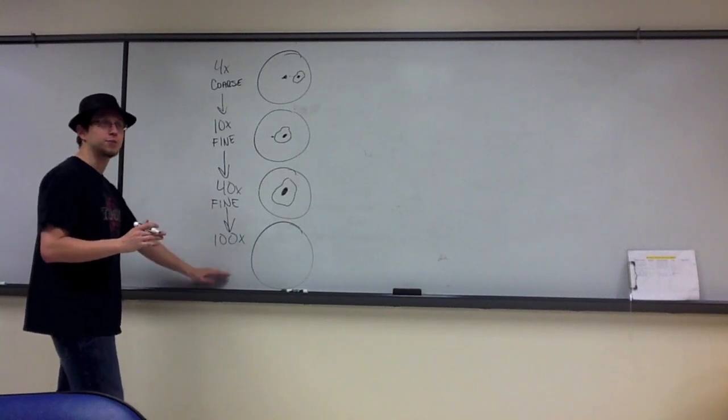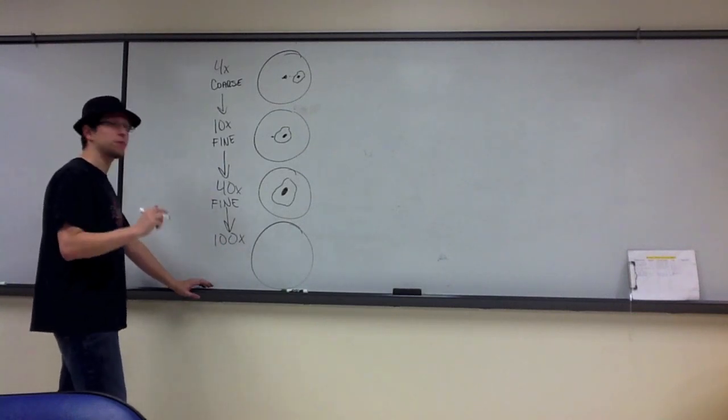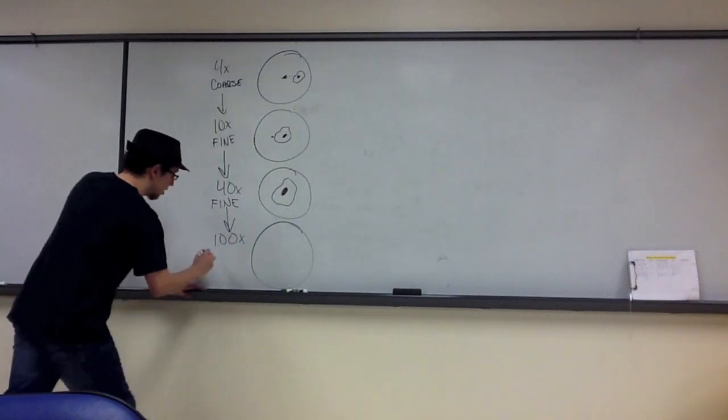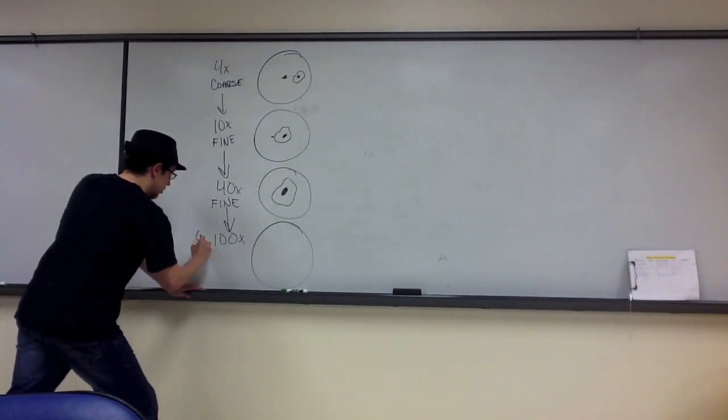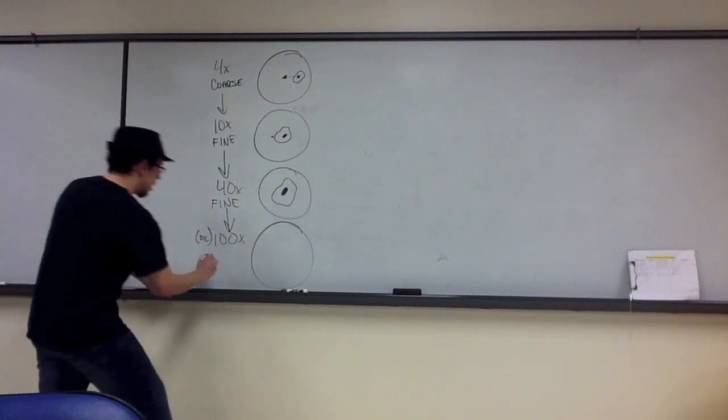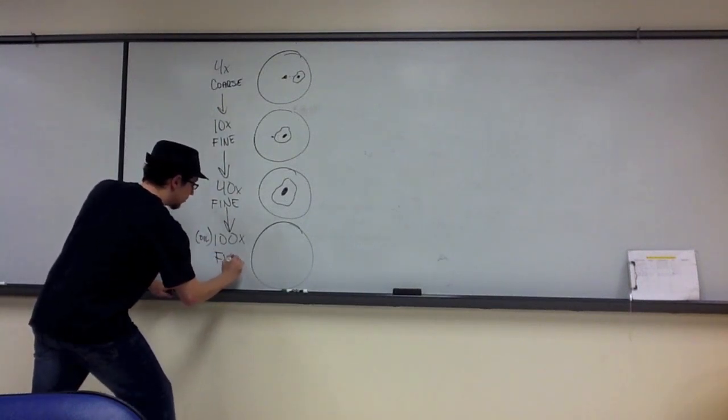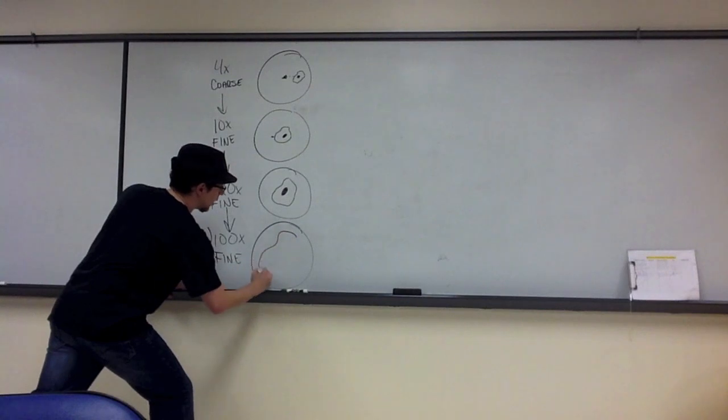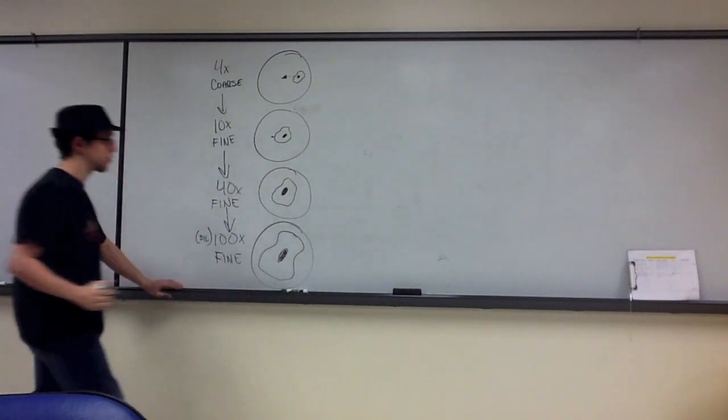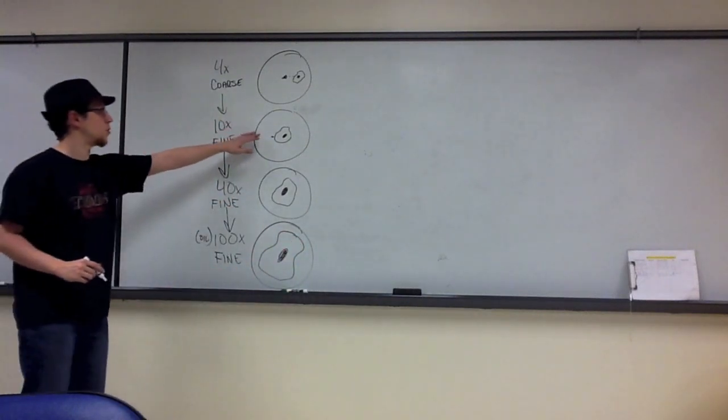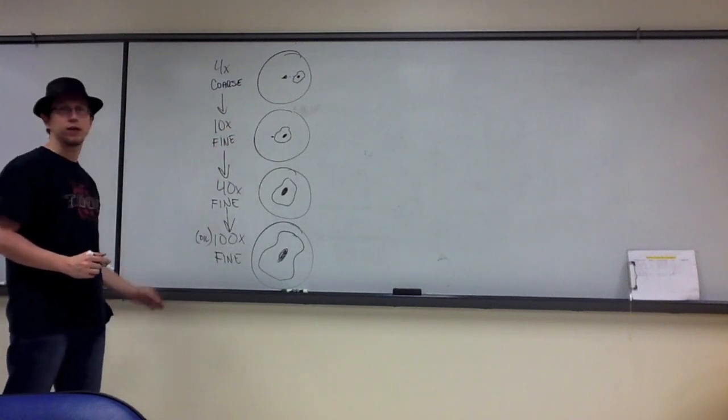If we use the 100x objective without oil, our sample is going to appear very fuzzy and we're probably not going to be able to bring it into focus. So I use oil with 100x, and I'm going to use the fine focus to bring it into focus, and then hopefully I get my cheek cell. This is what happens if you constantly recenter and refocus.